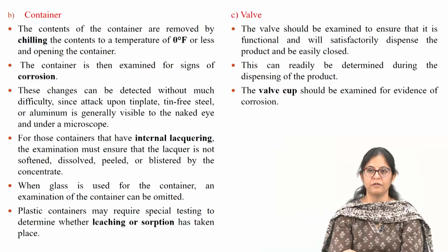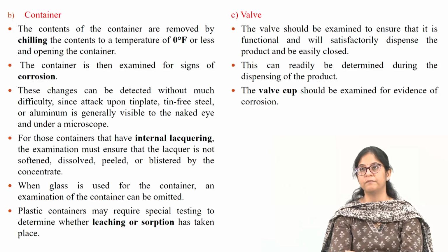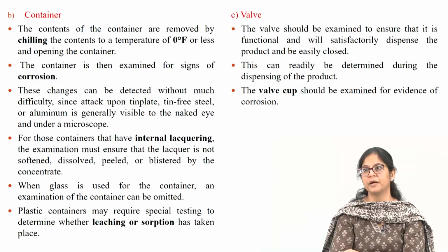Plastic containers may require special testing to determine whether leaching or absorption has taken place. The valve should be examined to ensure that it is functional and will satisfactorily dispense the product and be easily closed. This can be readily determined by the dispensing of the product.